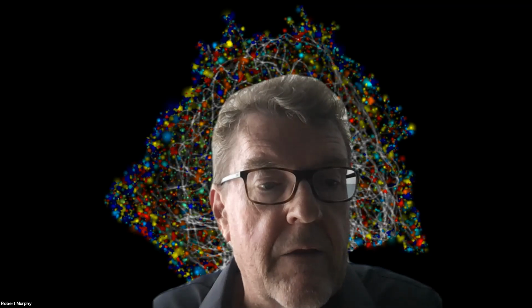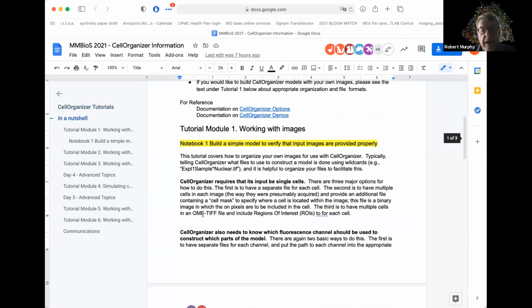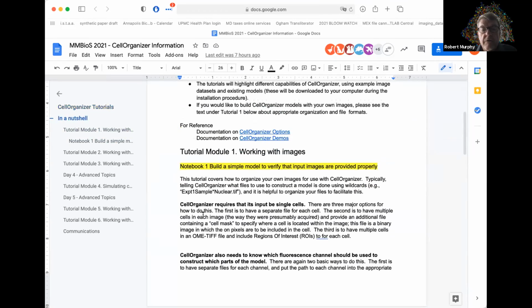I can maybe start by pointing you to the description of them and say a few words about them. So the things we prepared for tutorials for today are these three.